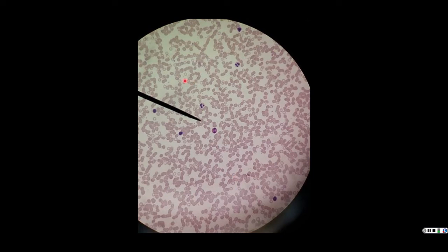We see these kind of pink, or even in some cases white, round, kind of donut looking or Cheerio looking structures. We see a clear background, and then we see some other things that look like either pink or clear or faint blue blobs with very dark purple blobs inside of them.